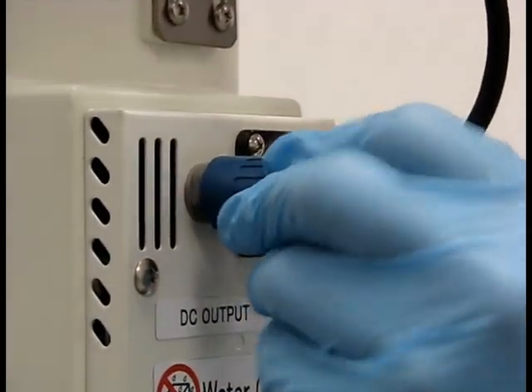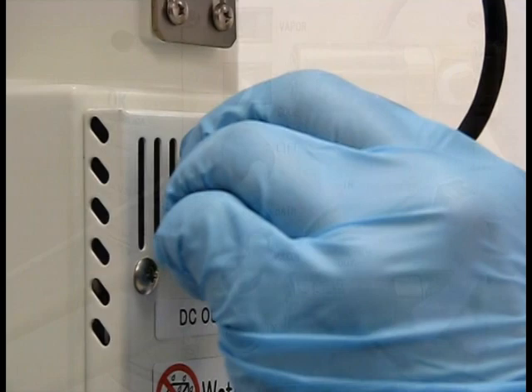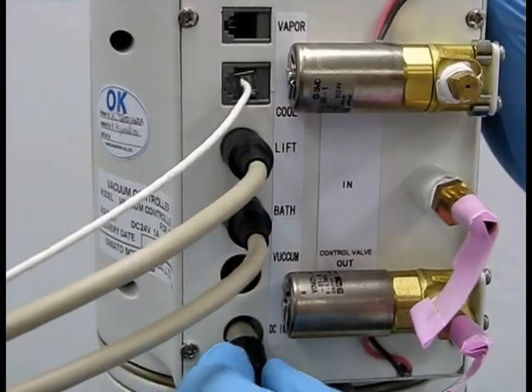Connect and fasten the larger male plug of the DC harness to the main unit and the smaller male plug to the vacuum regulator.